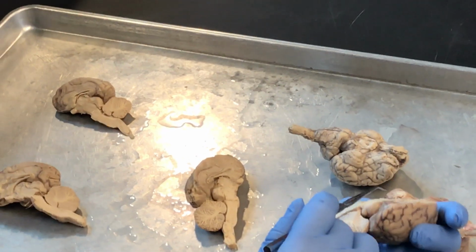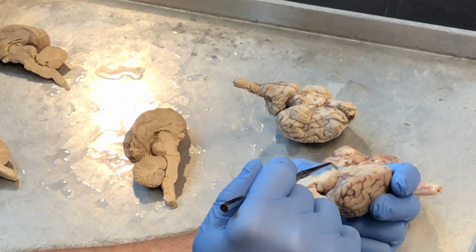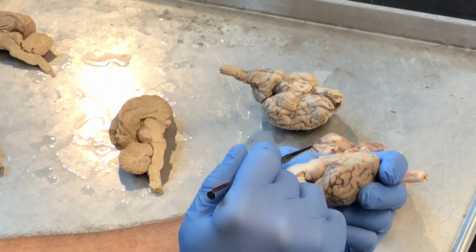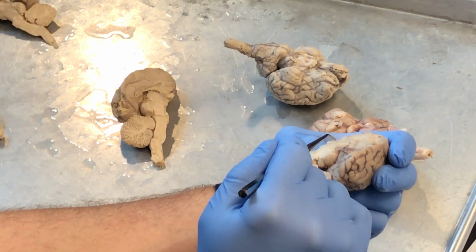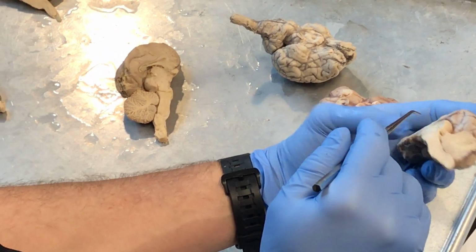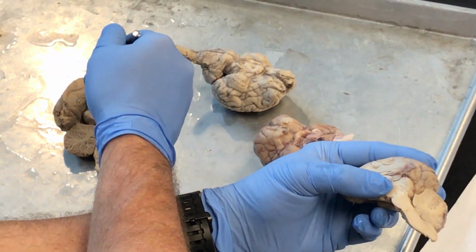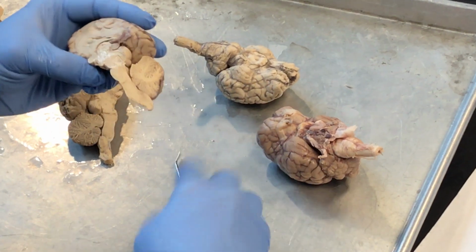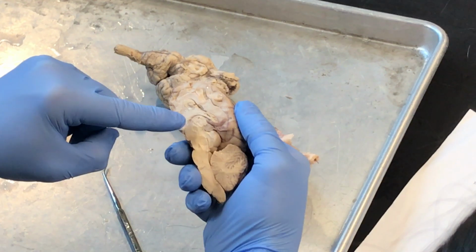Well, it just so happens that the third ventricle is where the hypothalamus is. Say it again. Third ventricle is where the hypothalamus is. You say, well, Dr. Simpson, how can the third ventricle and the hypothalamus be the same thing? Because the hypothalamus is tissue. The third ventricle is an open space inside the brain. So where's the hypothalamus set? Right in the midline. See, it sits right there.